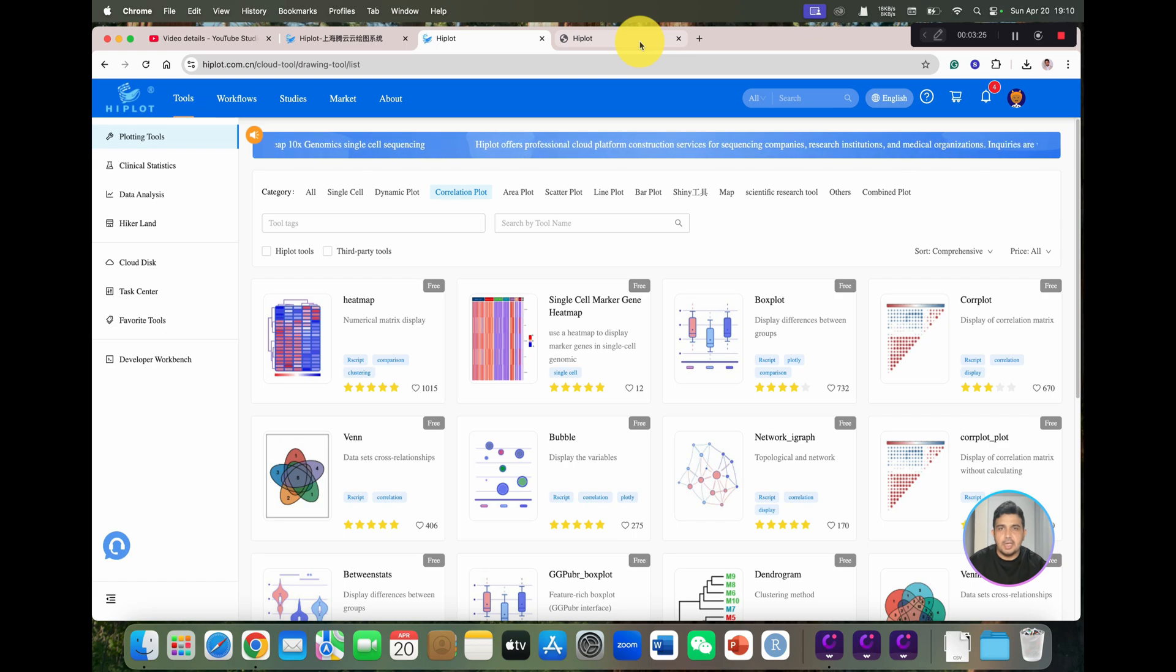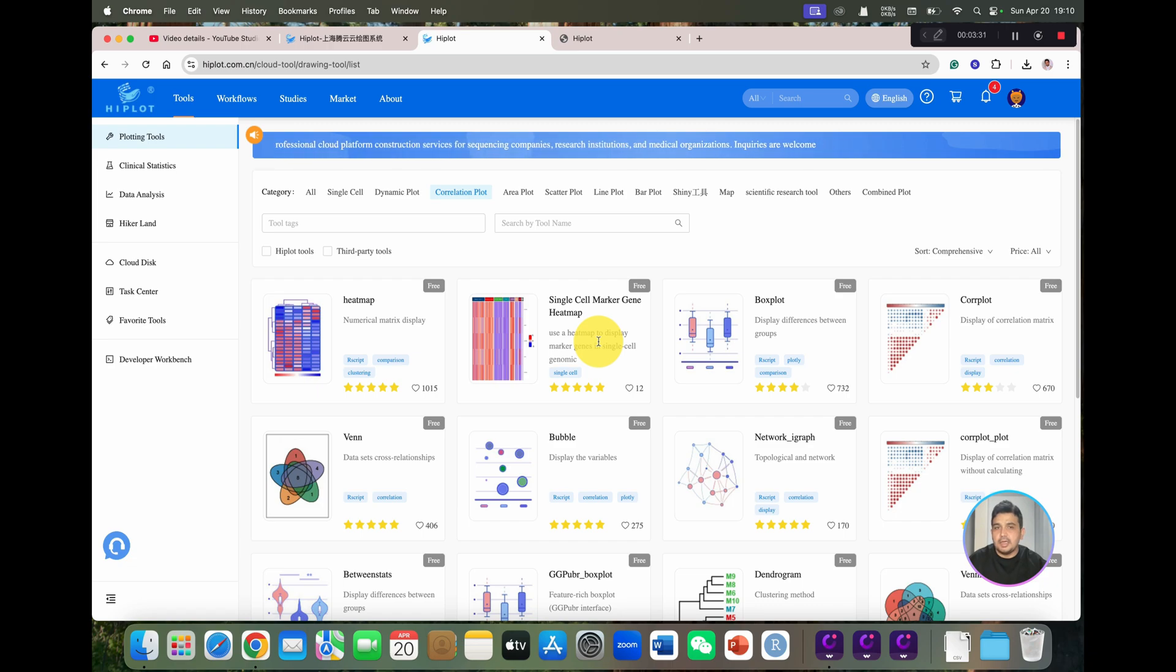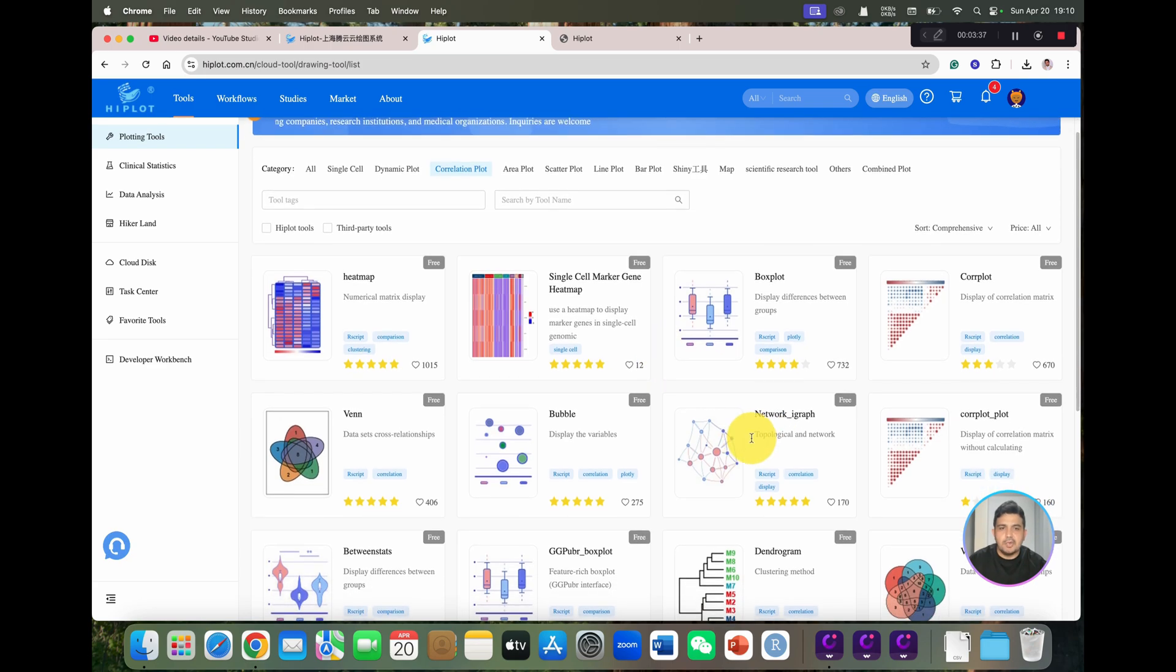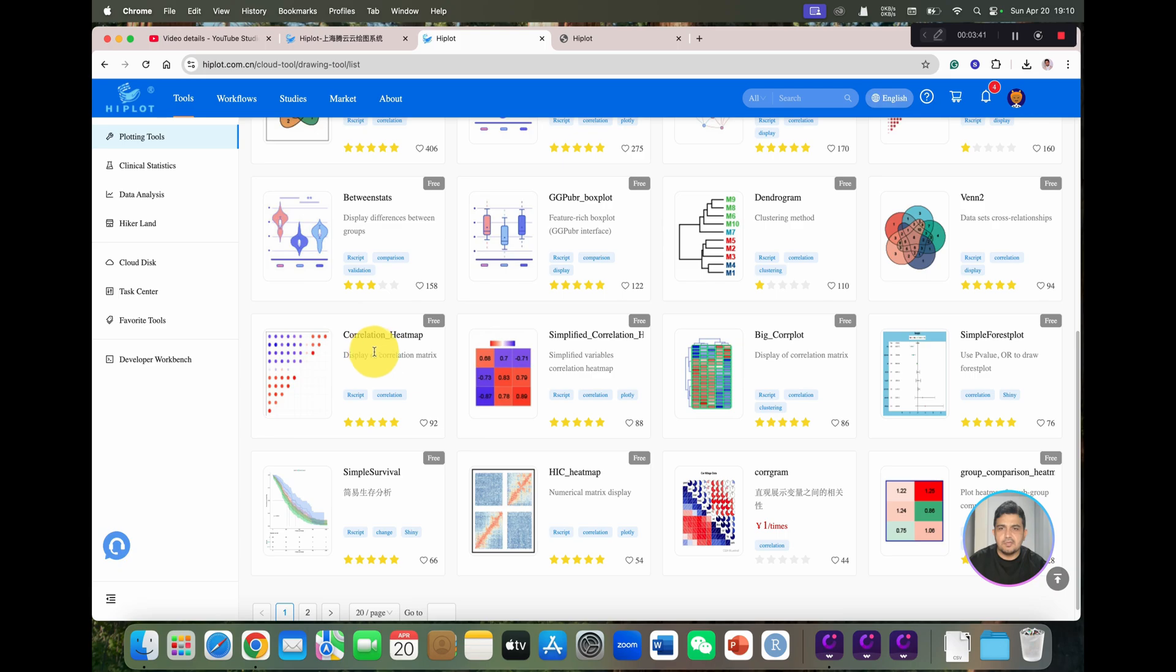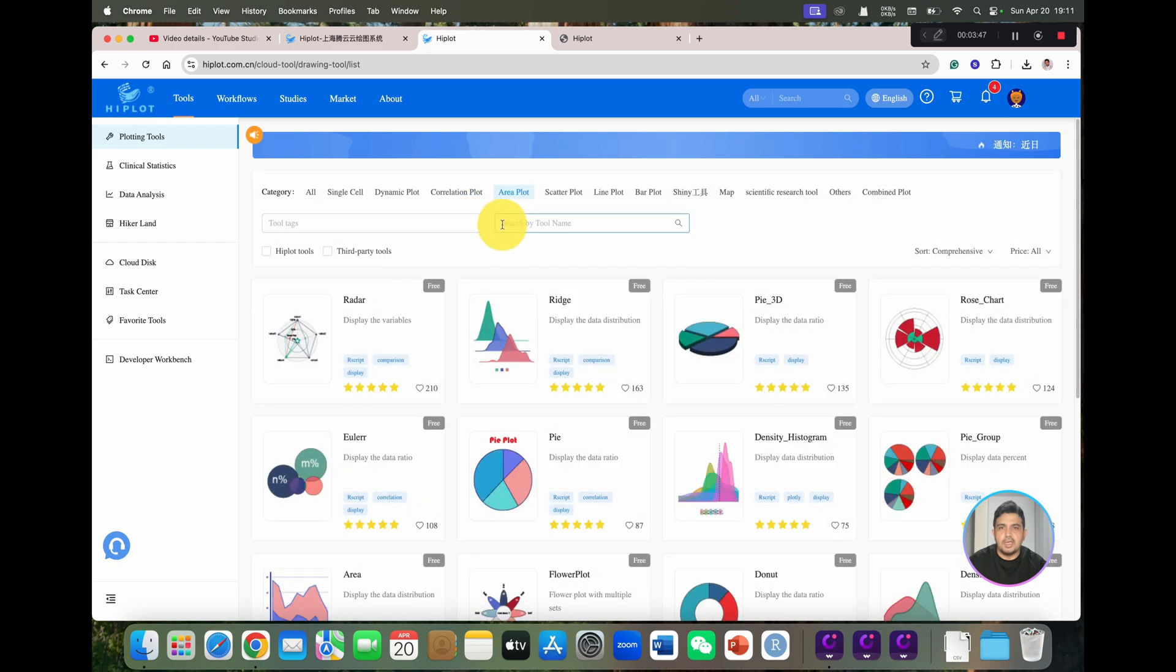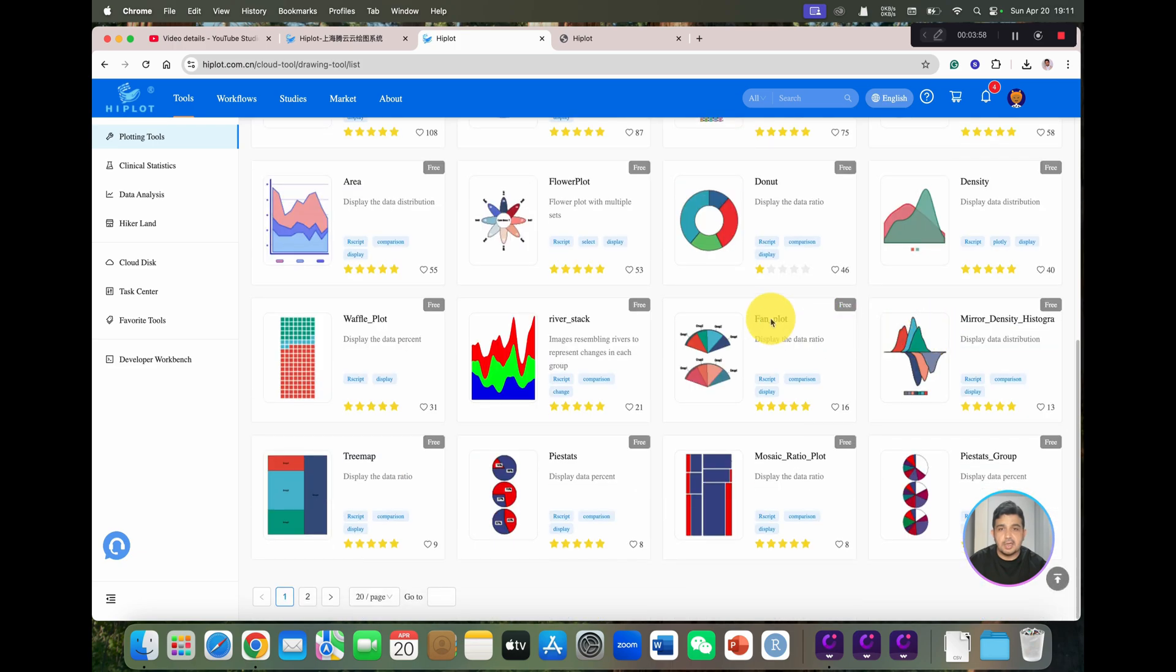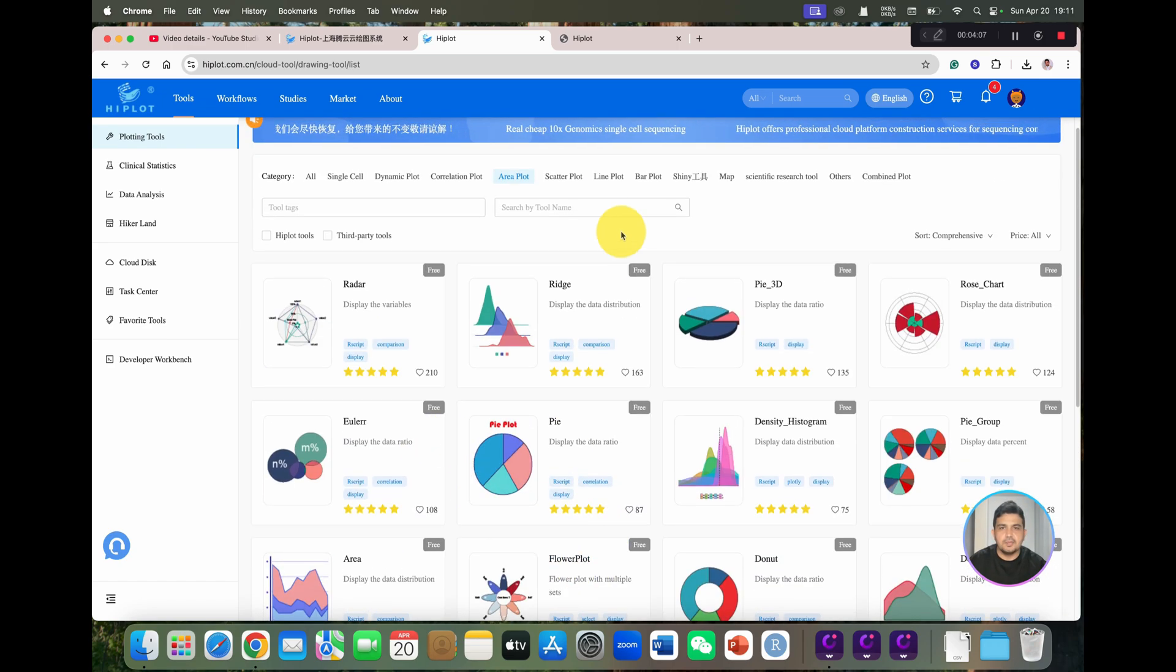I will open this in a new tab. I will show you later how you can edit this data and upload your data to get your box plot. We have dendrograms, and you can see we have different options for correlation heat maps. And a few more, we can also get area plots. You can see we have radar plot and ridge plot, 3D pie diagram, and rose diagram. And a few more, you can see we have mosaic ratio plot, tree sets, and flower plot.